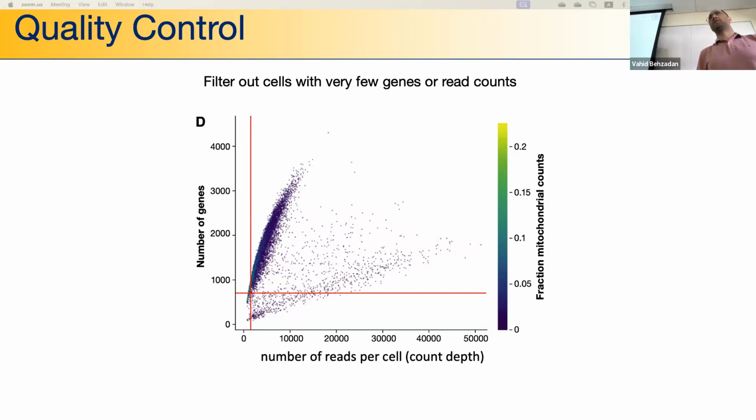I'm not sure if I understand your question correctly, because here we're not developing an application. We're trying to understand the biology in order to find the key characteristics of a disease development. So let's say you're studying cancer, right? Sometimes cancer can happen due to mutations in some genes.